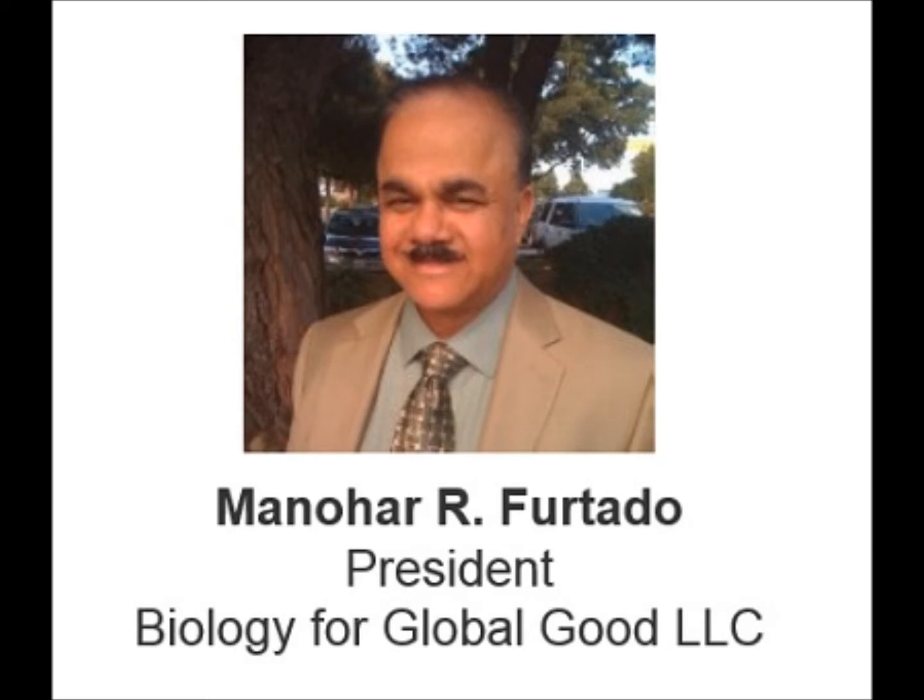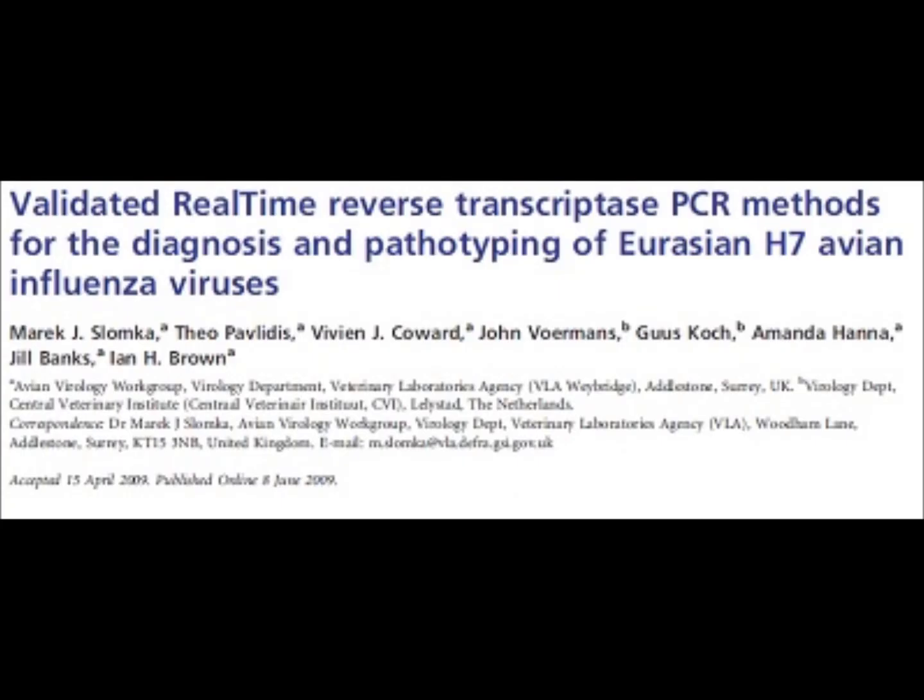Dr. Furtado, how do RT-PCR technologies compare with culture and other traditional methods? There's been a lot of study on this with the large number of viruses, as I mentioned, HIV, hepatitis C, and influenza.